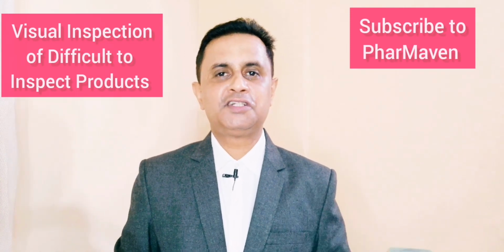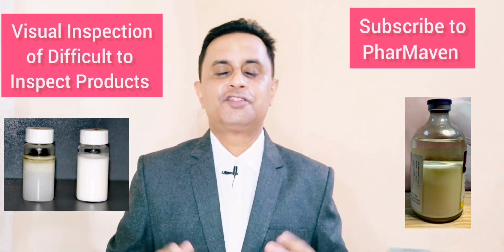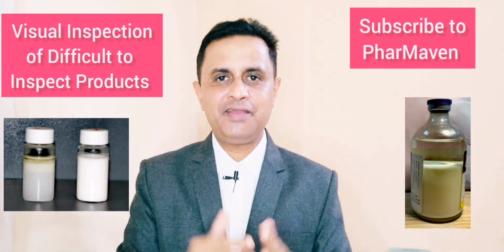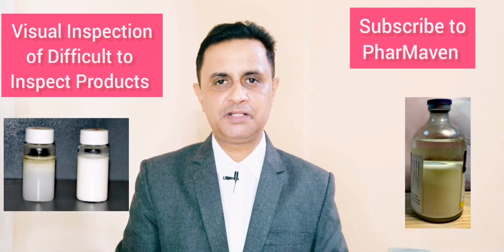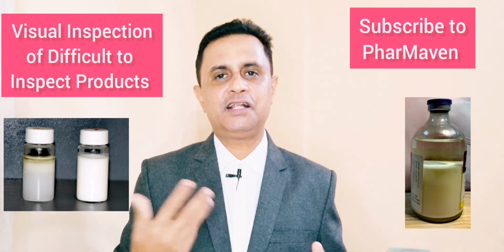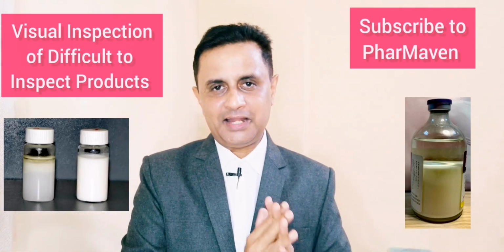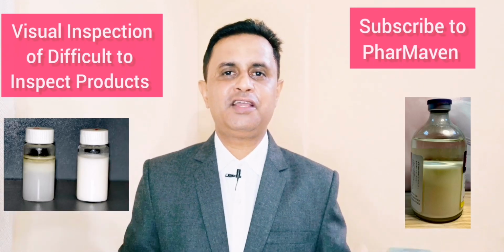Now coming to emulsions and suspensions, what can we do with them? Certain products may have inherent particles. Suspension is particles, emulsion may have globules. These are the allowed inherent particles as per the product, which is acceptable. But what about the external particles?